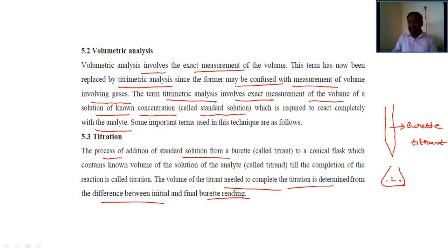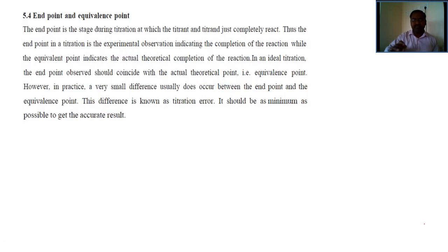In that conical flask, the solution is there, and that is the analyte. At the end point of the titration, we are going to find the titrant value.